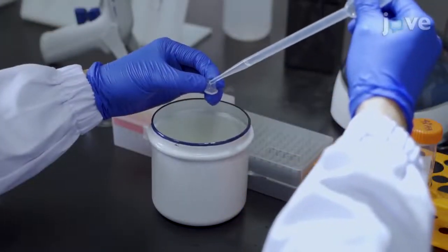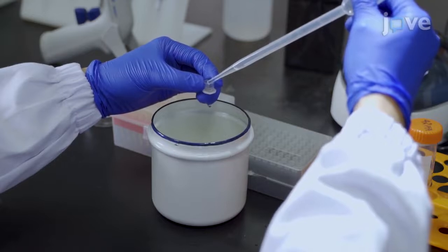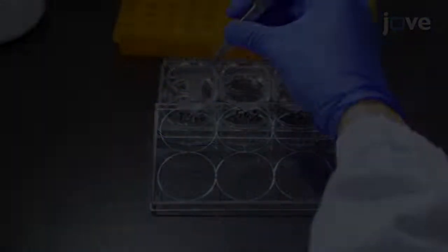After fixing, washing, and dehydrating the embryos as described in the manuscript, place the embryos in a sieve with nylon mesh at the bottom. Hydrate the embryos as described.